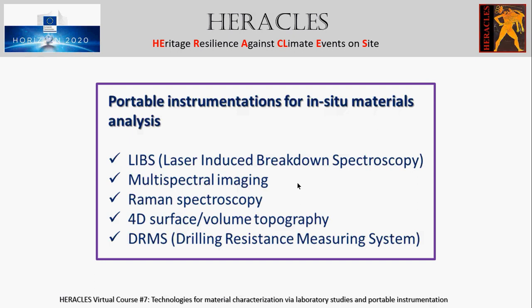Another technique is the 4D surface volume topography, which is a non-invasive, non-destructive, portable, and low-cost technique to measure the topology of a surface and its variations over time.